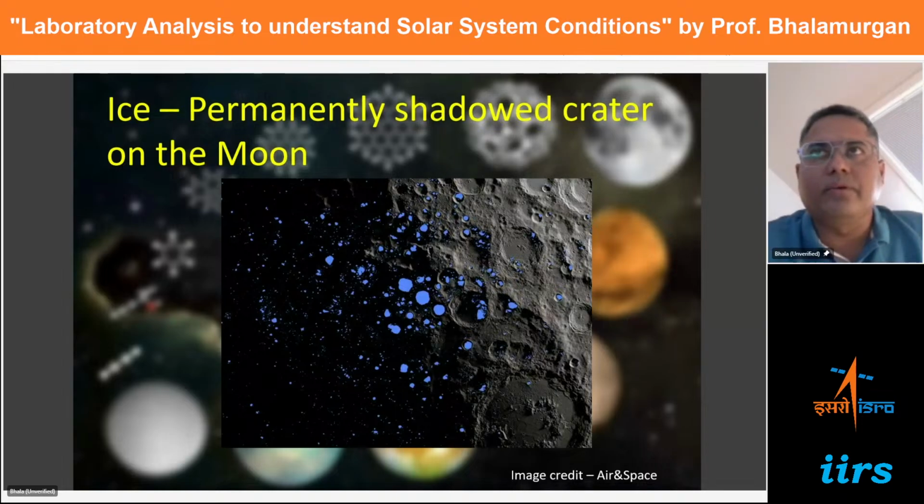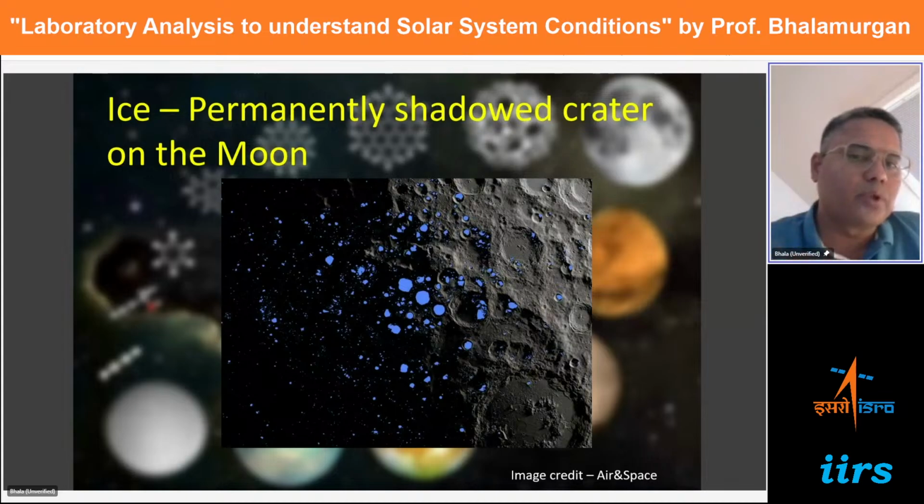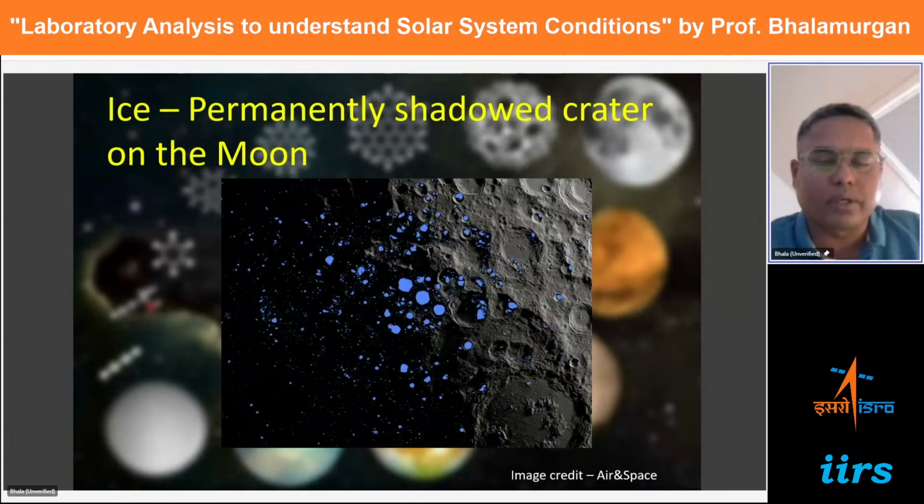But if you carefully look into the physics, both the plates get colder, right? But the plate which you take after 10 days keeps on accumulating the water molecules on the surface, building the ice. So the ice is quite thick. It is building the layers. The ice is quite thick that we can see. But the other plate, which is also getting colder, within that 15 to 30 minutes, there are molecules of water on the surface forming the ice layer, but beyond the detection limit.